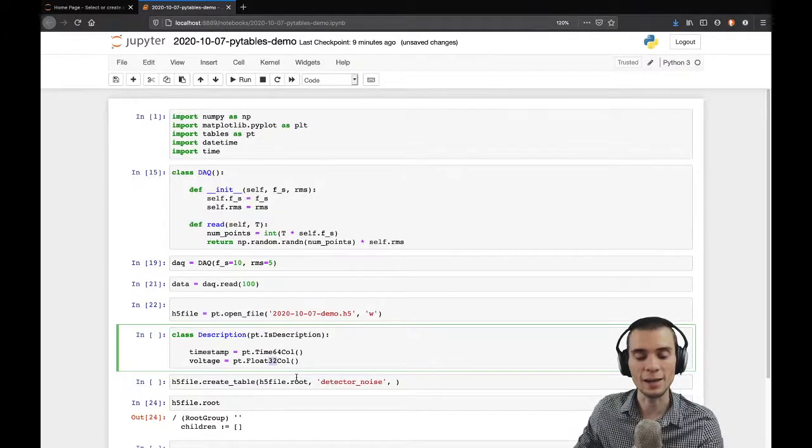If you're doing very fine measurements where you have very, very small changes, basically where the value is going to have the same first five, six numbers, but then the last one is changing just a little bit, then you would probably want finer resolution with a 64 col. And that's probably all I'll say about that for now.